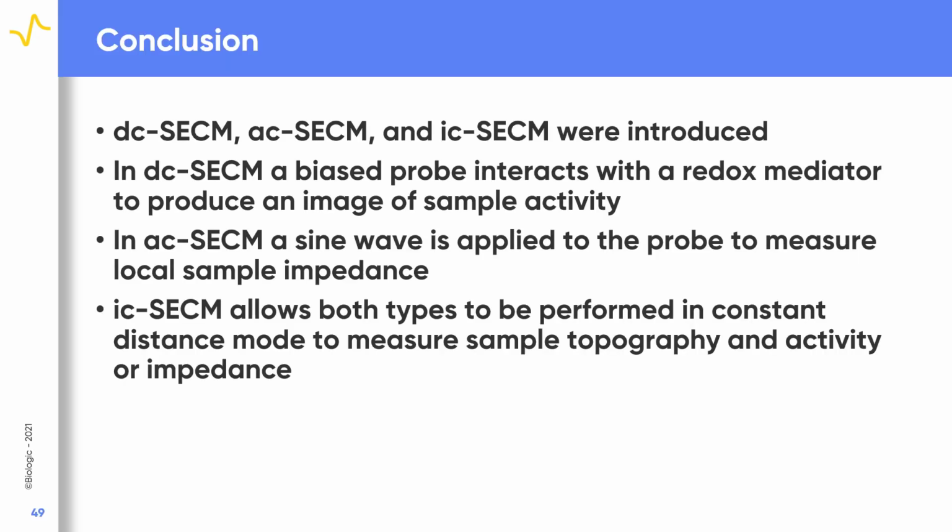In this video, we introduce the different forms of SECM available on the M470. These are dc-SECM, ac-SECM, and ic-SECM. When dc-SECM is used, the probe is biased to interact with a redox mediator. The signal measured in these experiments reflects the local sample activity.